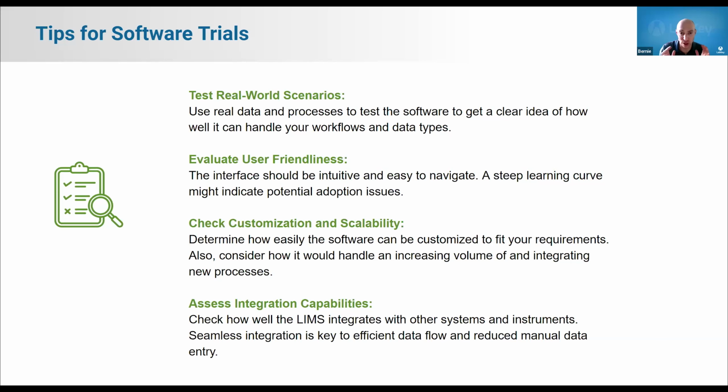I cannot emphasize this enough. Using your real data is one of the best ways to make sure that what you want and expect to get out of it will actually be there. How do you actually get through your processes in the software? Actually set that up, walk through it, see what it looks and feels like. It can also help you understand how intuitive and useful the product is, which can in turn impact adoption difficulty.